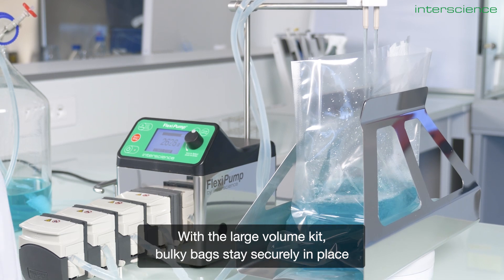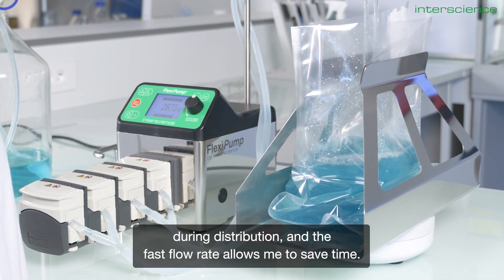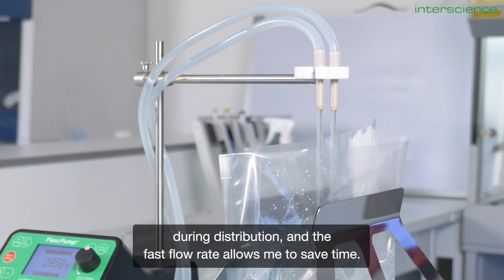With the large volume kit, the bulk bags stay securely in place during distribution and the fast flow rate allows me to save time.